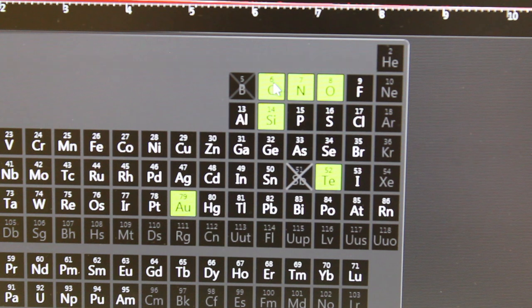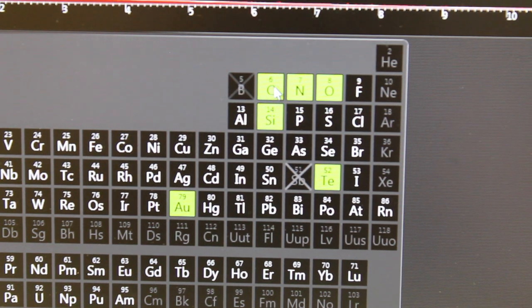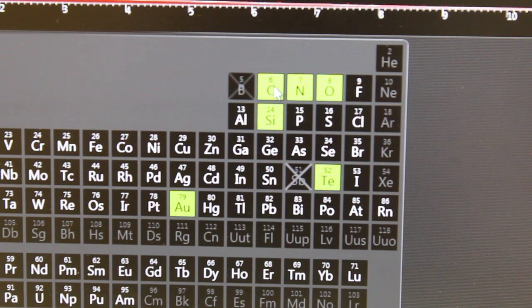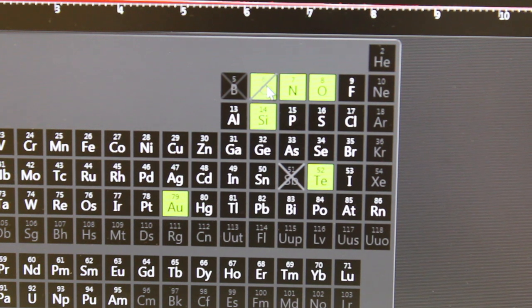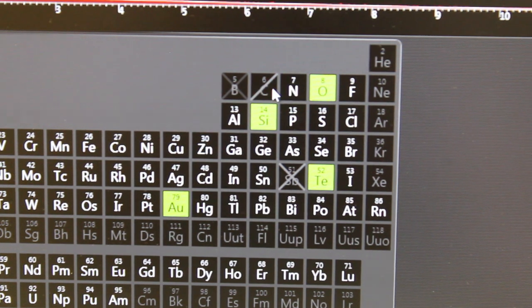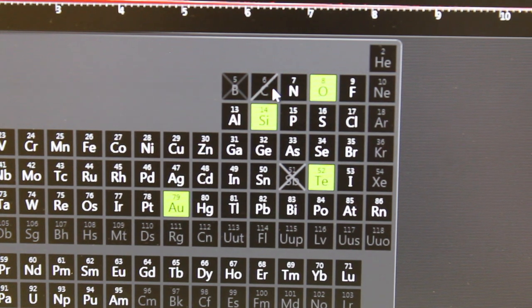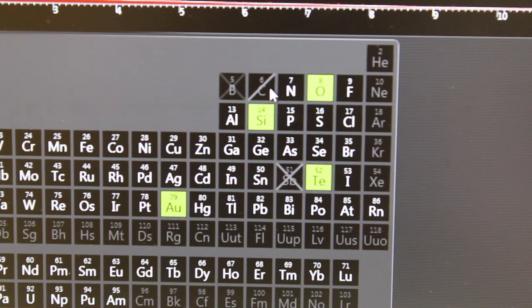For example, we know that there's carbon on the surface of the thin section because we carbon coated it. So we might click on this and decide we're not going to count carbon in our chemical analyses because we know it's a surface feature.